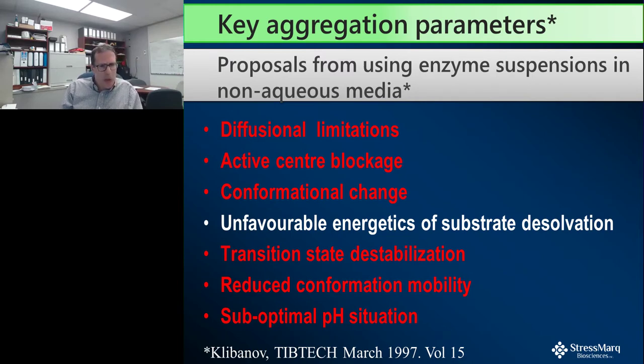So I looked at some of the key criteria that the laboratory used to look at in those days, because we had one key element that we needed to try to answer. And that was, why are those reactions so incredibly slow? You can definitely do interesting things, but the actual speed of reaction can be up to 1 million-fold slower than it is in water. Now, again, a very different situation to what we have with fibrils, and yet we know that we dramatically slow down the reaction if we don't sonicate. So I wondered whether there were some parallels here.